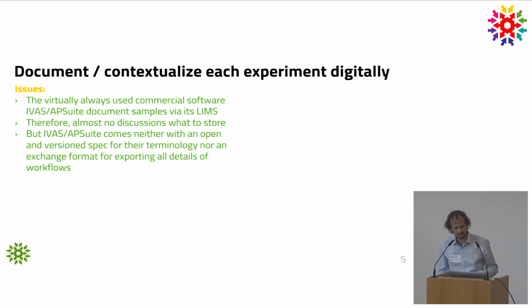The problem is that these files typically have no contextualization inside that tells you anything. You can sell me anything as a POS file, and I wouldn't even know whether it's a data set.